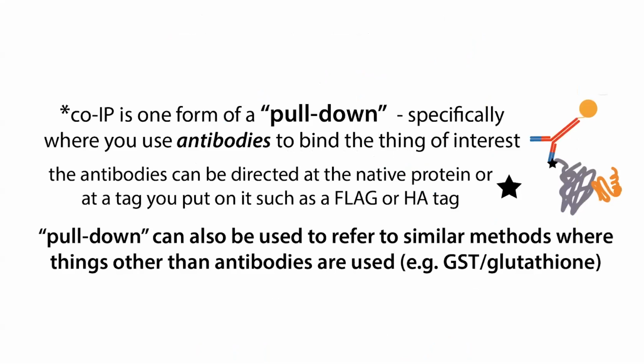But if you have some sort of little epitope tag, like a FLAG tag or an HA tag, well, lots of people use those. These companies sell you those antibodies, and you can get them with the beads directly attached, rather than having to attach the antibodies to the beads yourself.